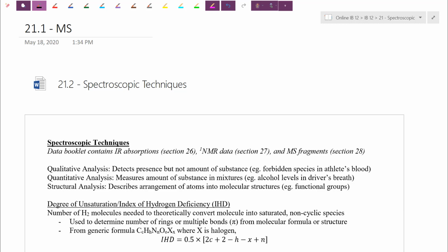Each of the instruments is going to use a different energy form. Some use X-rays, some use IR radiation. They're all going to give us hints to what the molecule looks like. And like an investigator, we're going to go in, collect up all this evidence, and try to figure out what we've actually created. If you do this in detail, you can actually calculate the amounts of different functional groups present as well. But I just wanted to introduce some of these spectroscopic techniques to you here. This package you can find under the resources column here, and we'll just go from there.